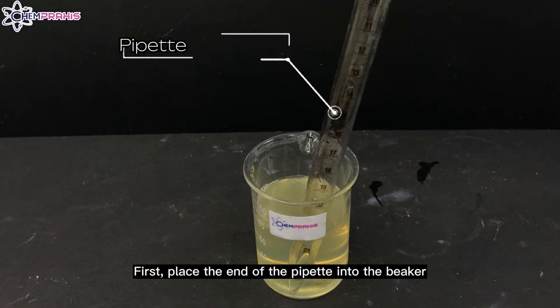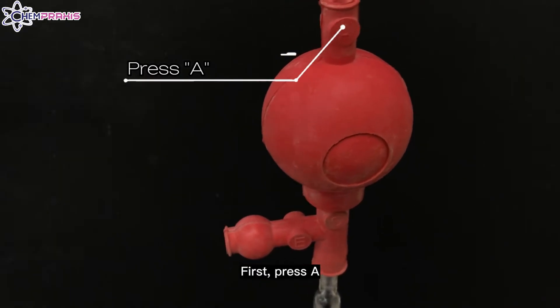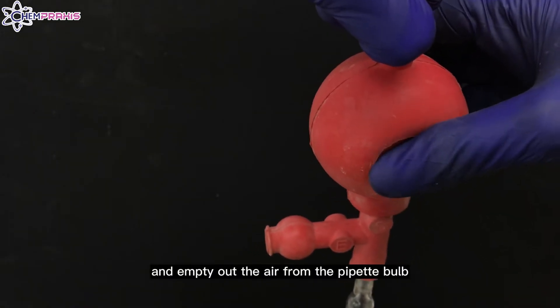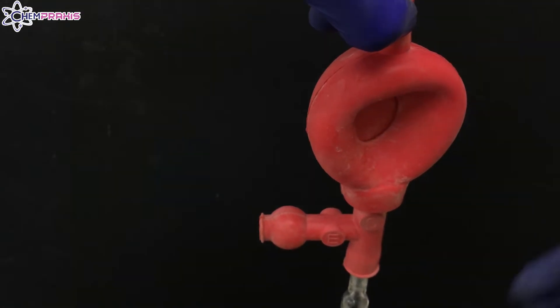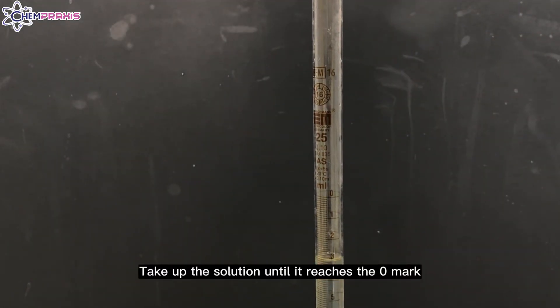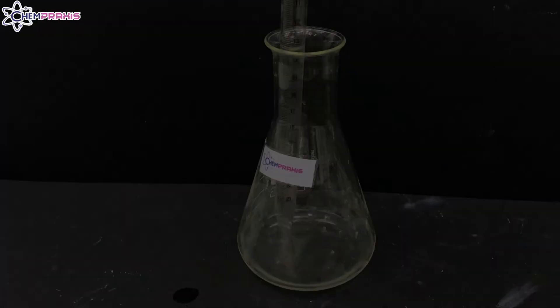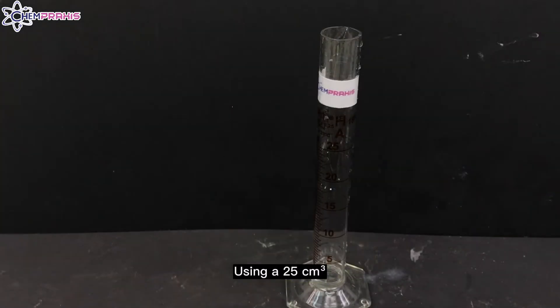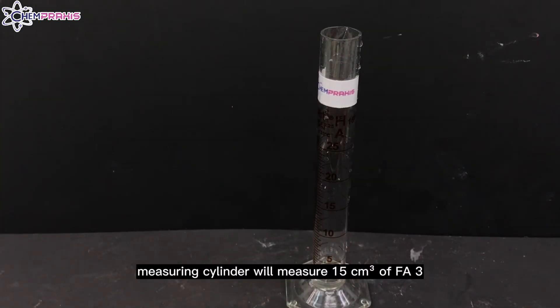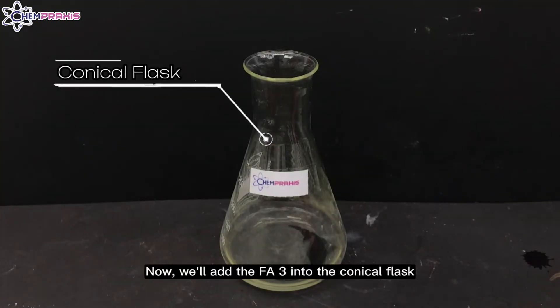Place the end of the pipette into the beaker and attach your pipette with a pipette filler. Press A to empty out the air from the pipette ball. Then press S to draw the solution up from the beaker until it reaches the zero mark. You can empty the solution into the conical flask by pressing E. Using a 25 cm³ measuring cylinder, we'll measure 15 cm³ of FA3 and add the FA3 into the conical flask.